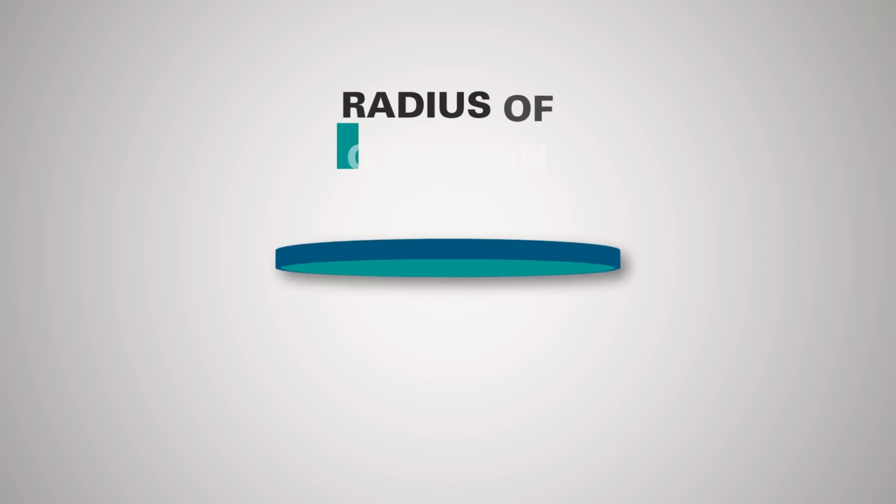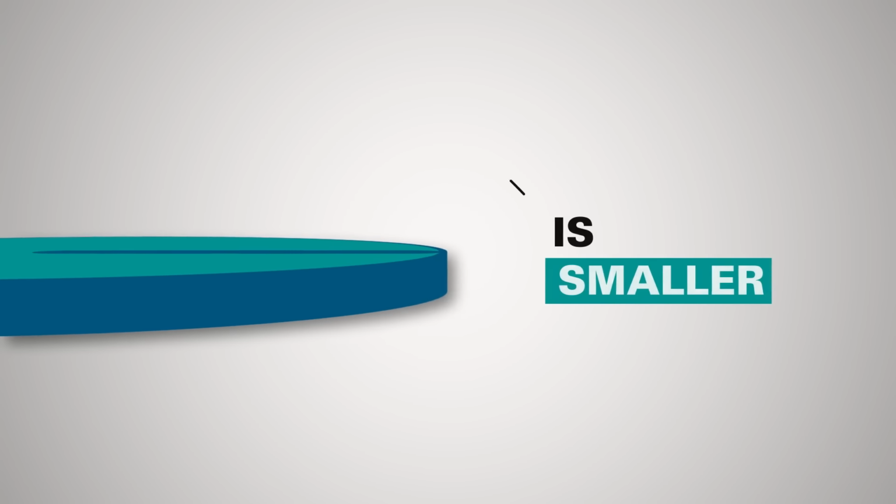In that case, the radius of gyration is the average from the shell to the center, so it is smaller than the real radius. With this information, for AAV, you can get a brief idea of the filling state. In the real case, the radius of gyration of a fully filled AAV is smaller than that of an empty AAV.